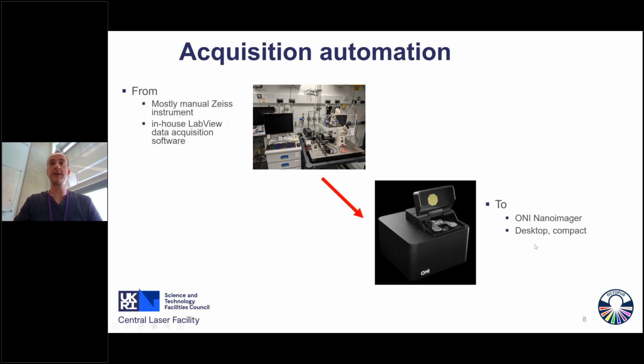So the advantage for us, I mean, it's obviously a lovely desktop compact instrument, which is great for putting in the clinic, but most critical for us in this project was just the ability to automate. So we wanted everything the microscope could do to be software controllable, and ideally, as it was, and as it is, Python scriptable. So basically, a super compact TIRF capable single molecule microscope that we could fully control with software. So we bought one of these and implemented our data acquisition pipeline within that.